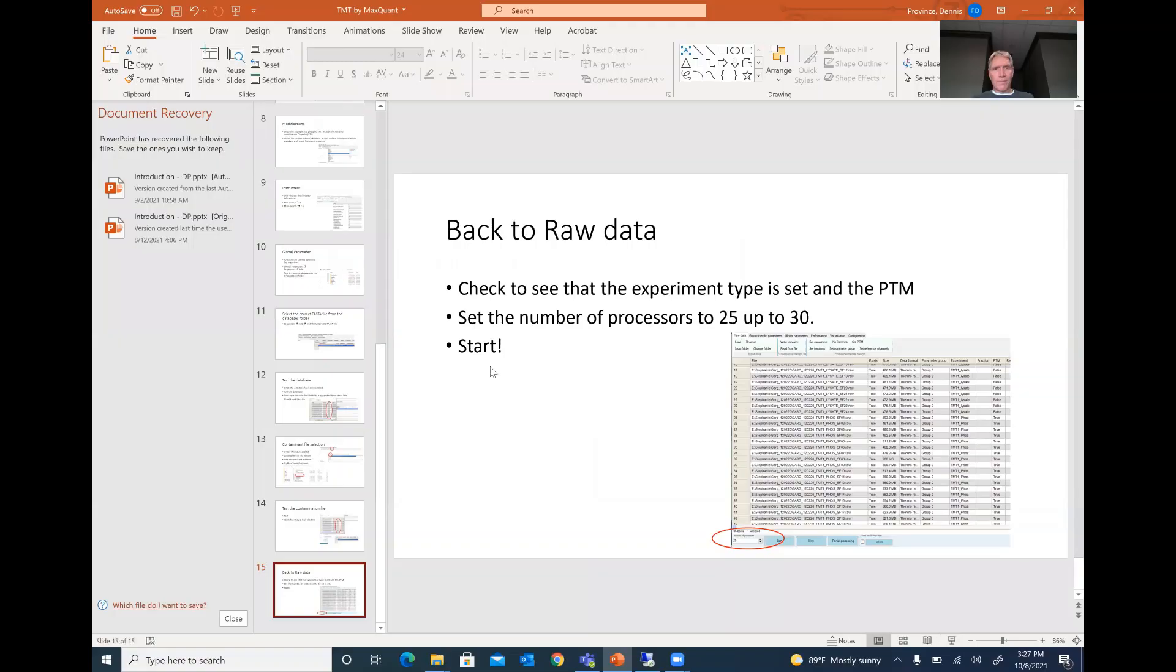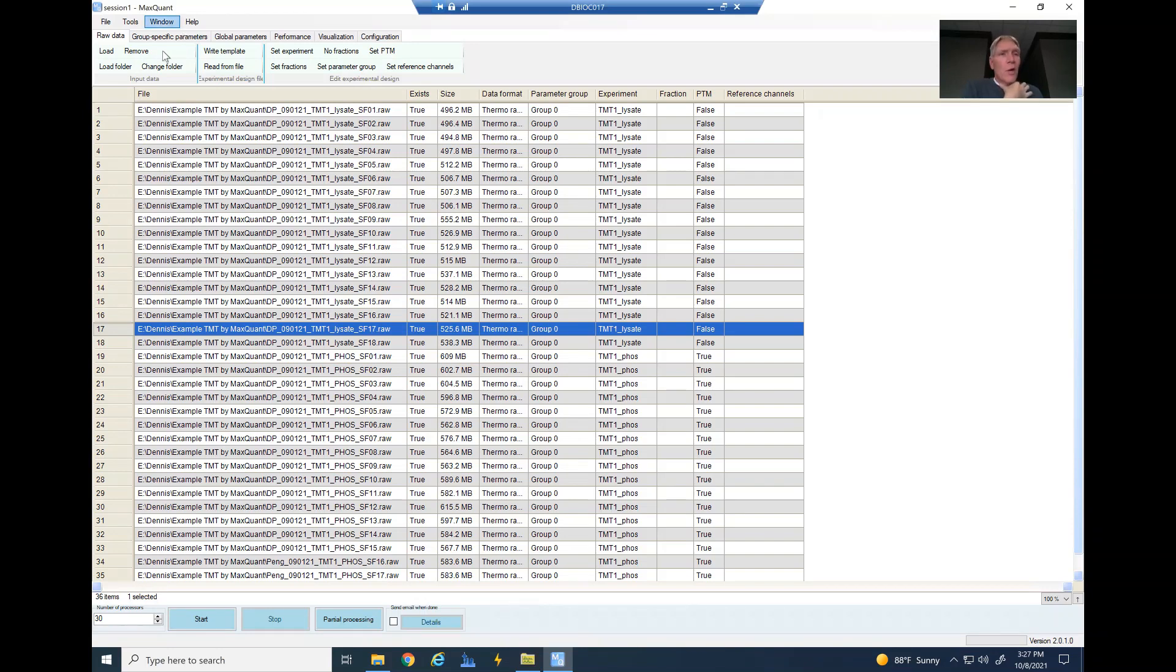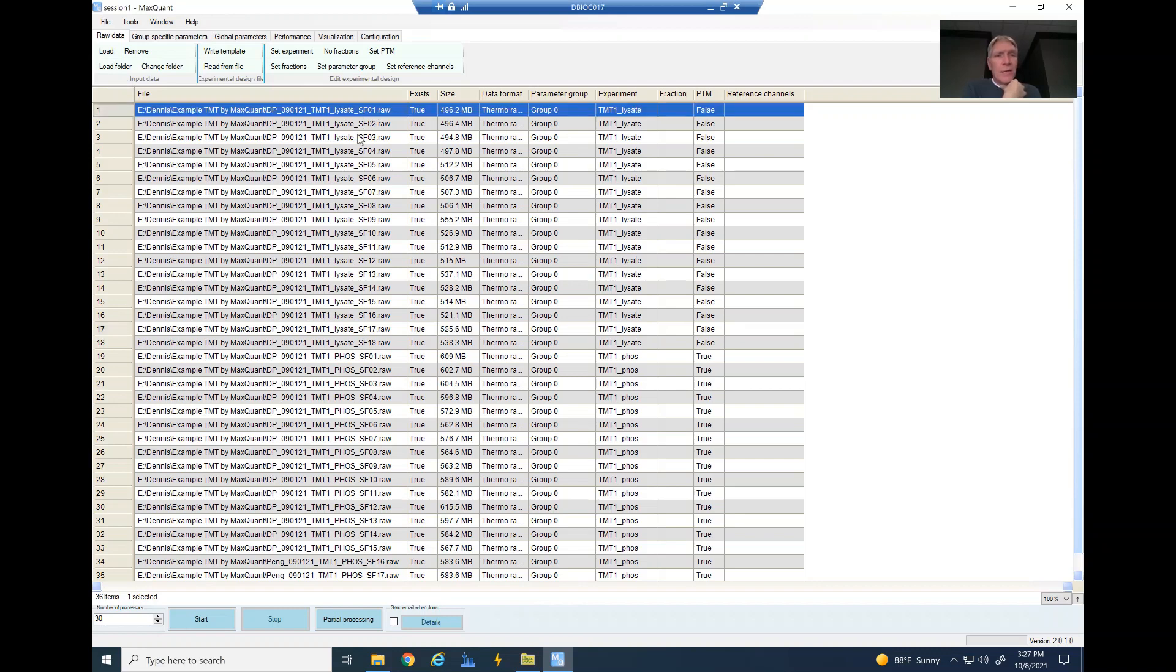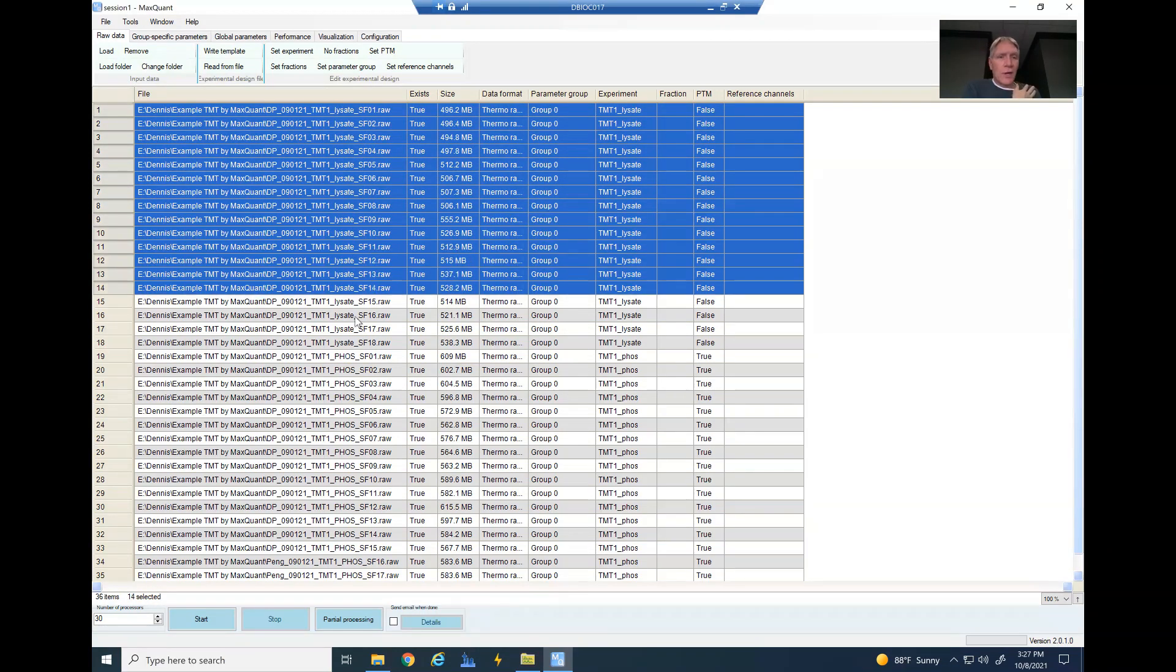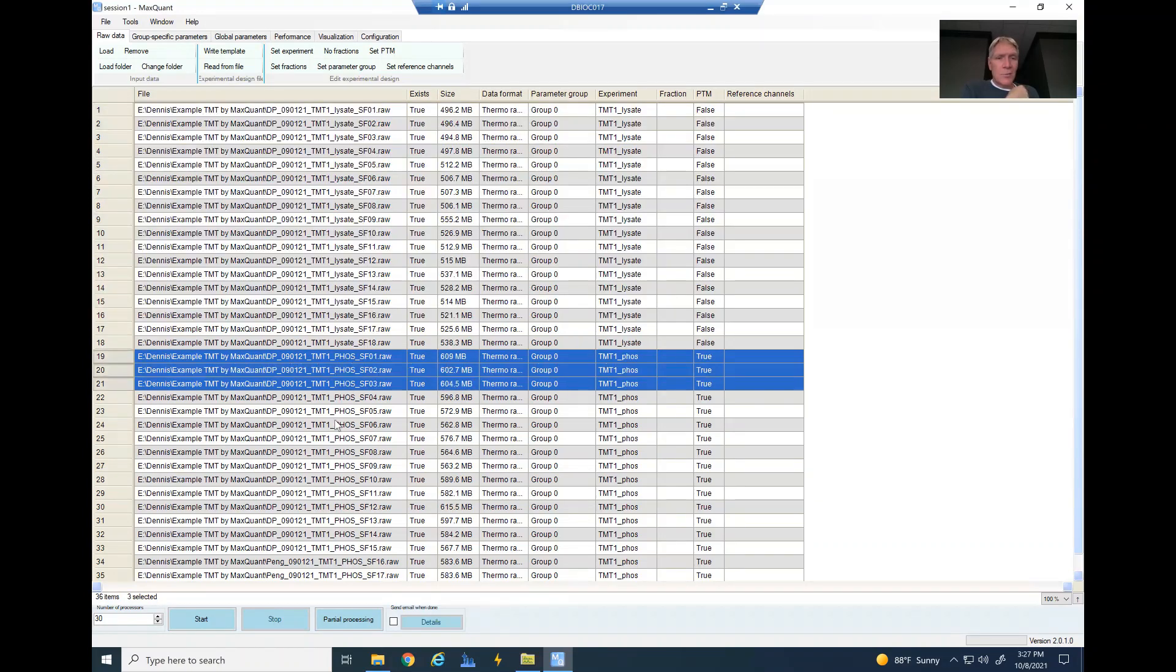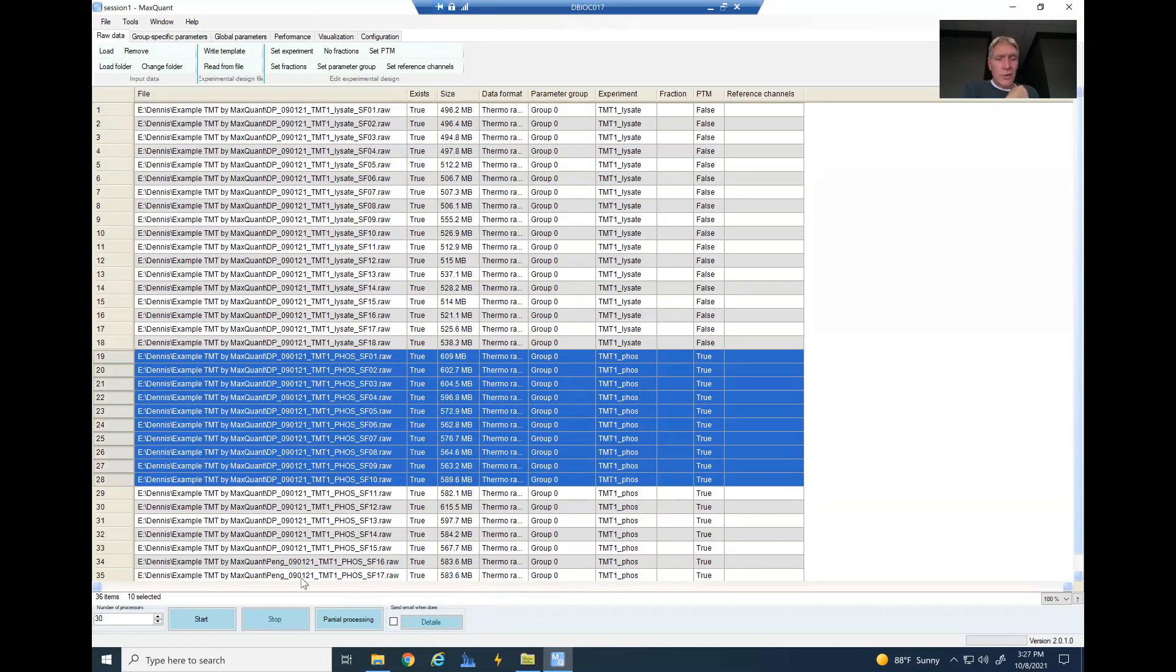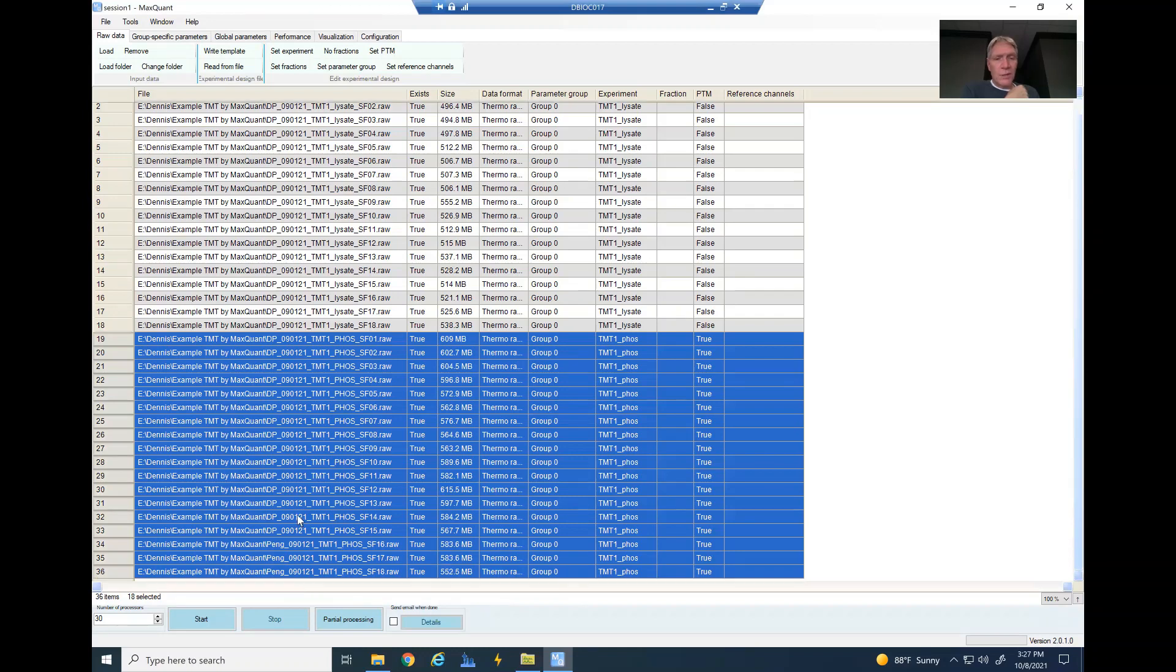So I'm going to come back out here and go over to where I have opened up MaxQuant. I have loaded up my data, and you can see I've got my data separated. I've got 18 superfractions here for my lysate, and I've got 18 superfractions here for my phospho experiment.